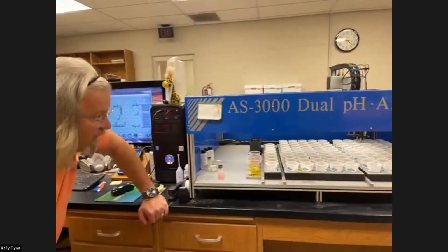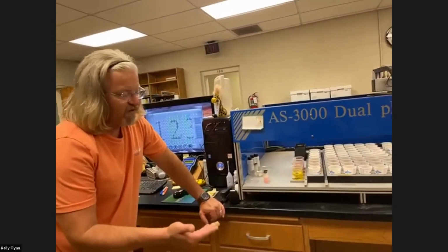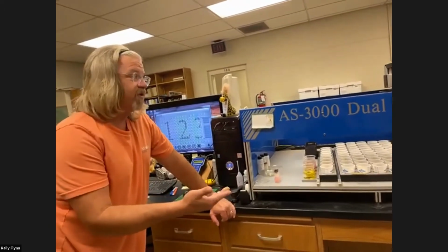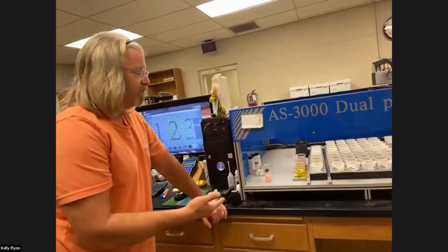But if there are pHs that are very high or very low, we can set the machine so that if we encounter a pH below 4, it'll go to the wash and wash those probes. If it's above 7, it'll go to the wash and wash those off. We don't wash between every one.